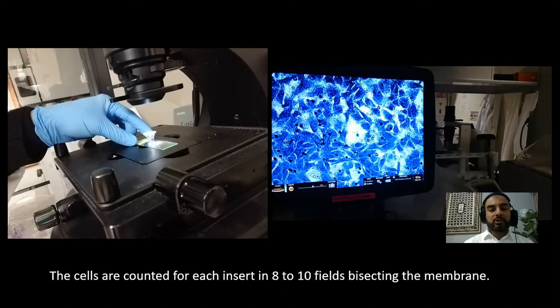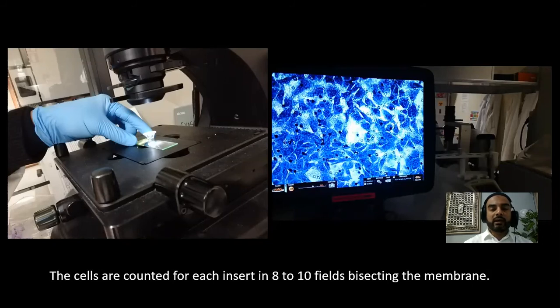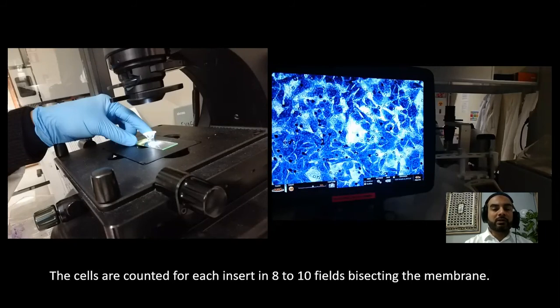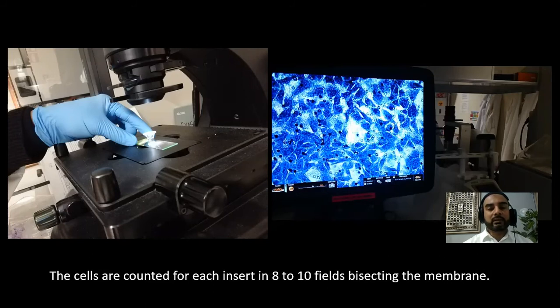When the inserts are dry, we count the cells under the microscope at 40x resolution, counting from eight to ten fields. Importantly, you do not want to count from the edges of the insert, because the cotton bud may not have reached the corners and unmigrated cells could remain there. You have to be gentle not to break the membrane, and wipe from the corners as much as possible. Here we can see the cells are stained beautifully.